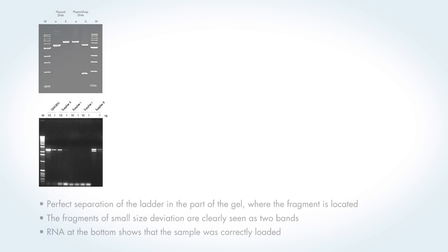The lower example shows a ladder that's not perfectly separated for larger fragments, but it works very well for the bands of interest. The double band is clearly seen as two bands, albeit with very small size deviation. The RNA bands on the lower end of the gel show that the samples were correctly loaded.